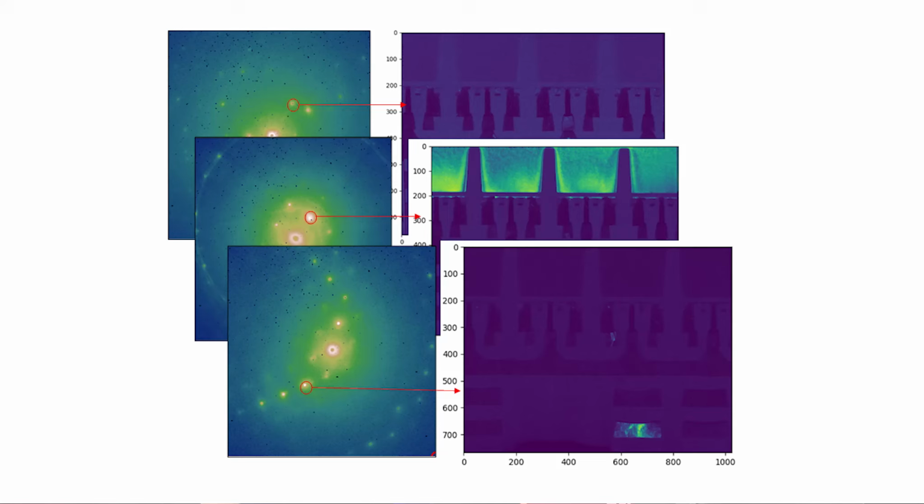So these images are binned based on your dwell time that you're using in your electron microscope. It's synchronized with your electron beam, and based on the information that you're collecting, mainly the timestamps, you create these images. So you can select basically any area on the detector, and in this way create the virtual aperture, and then recalculate the image that was already taken.